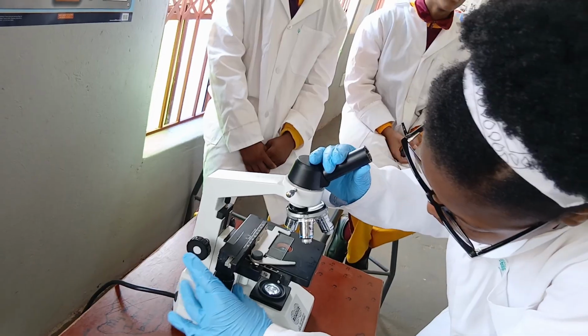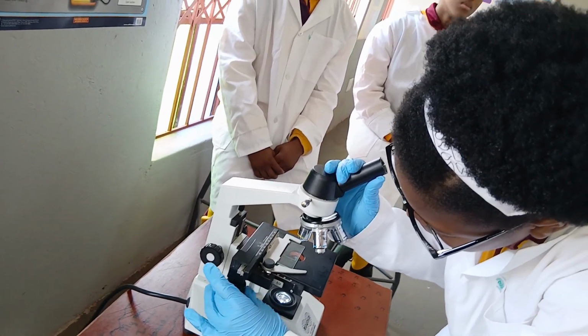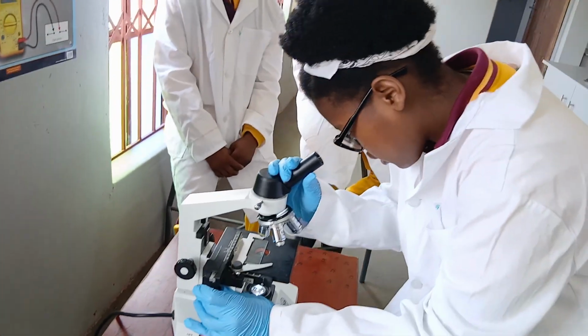Now we are using our x-axis to bring our slide forward to see our microorganism, as it was too far.